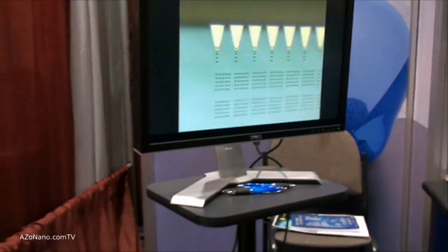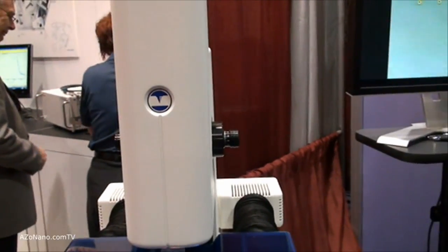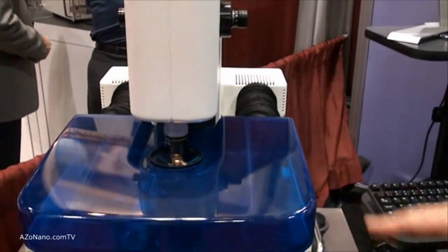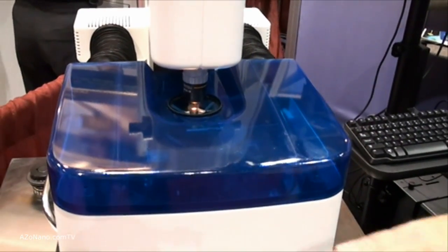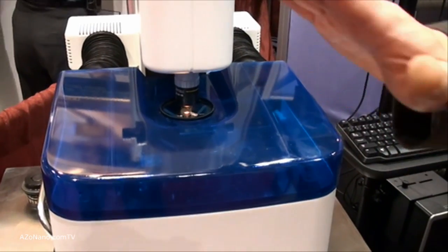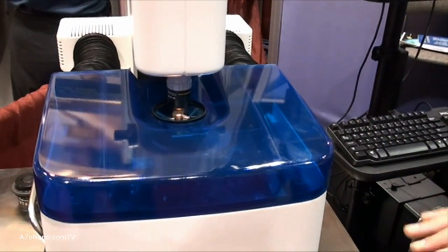Okay. And you've got a multi-axis stage you were telling us about that can tilt as well? True. We can follow the contours of surfaces here because we have five axes of stage. That's an X, a Y, a Z, and two cradles for tip and tilt in two dimensions, which allows us to program the stage.